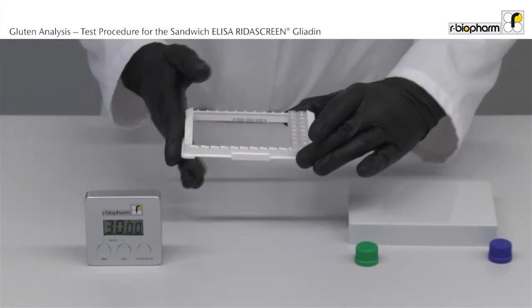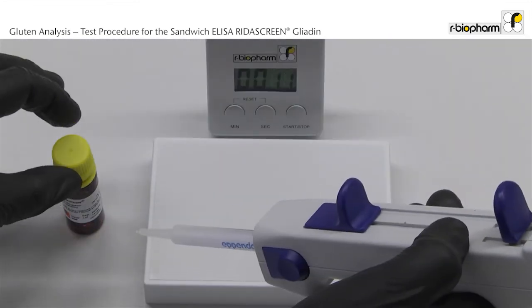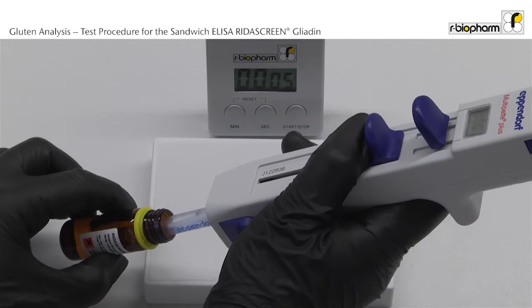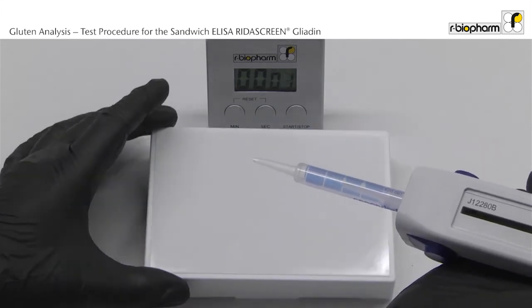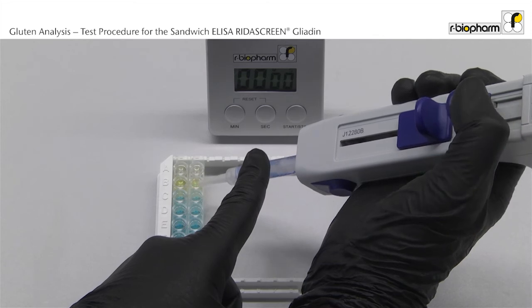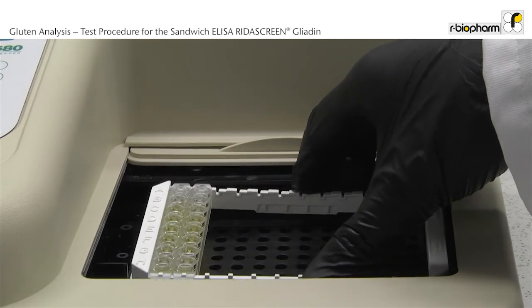Carefully rock the plate to mix substrate and conjugate. Incubate 30 minutes in the dark at room temperature. After the incubation, 100 µl of stop solution is added to each well with a multi-stepper. Measure the absorbance at 450 nm within 10 minutes.